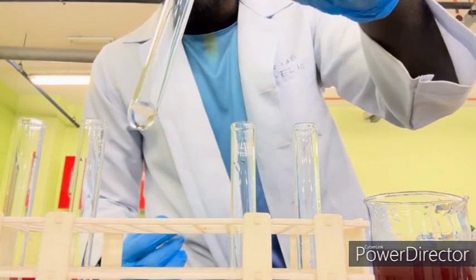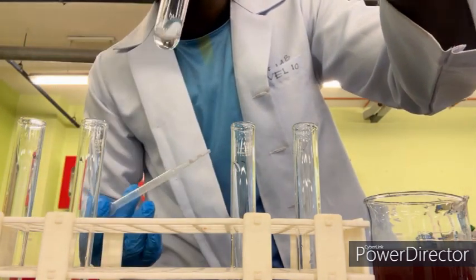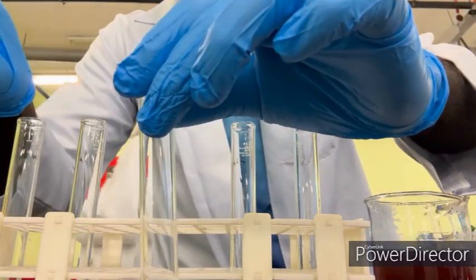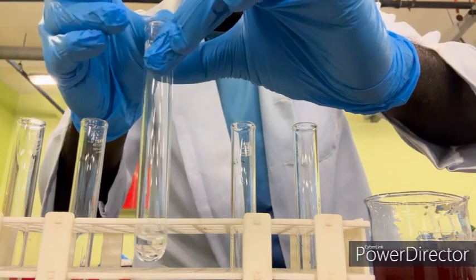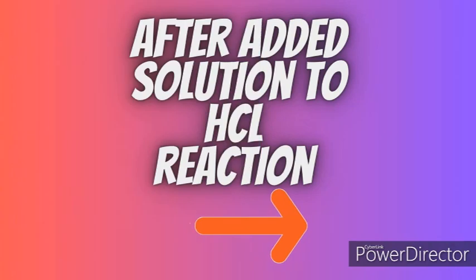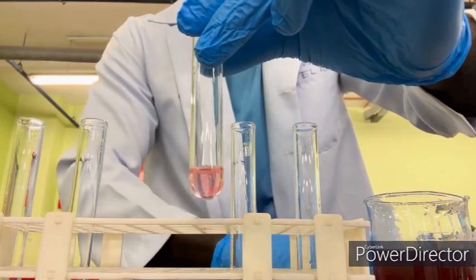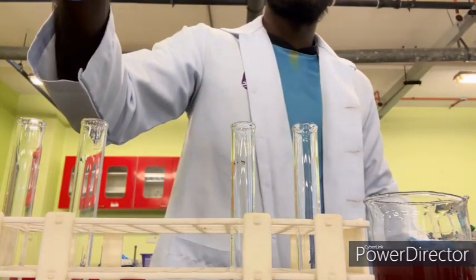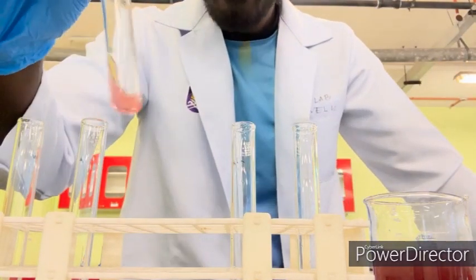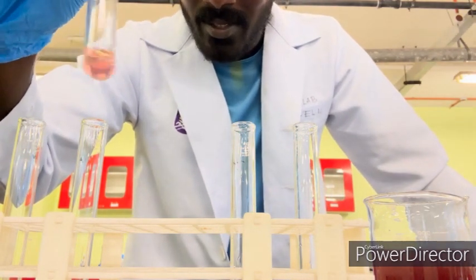And for the third one, I'm going to add the onion peel extraction to the HCl chemical. Okay, so for HCl, we can see there's a massive change of color.